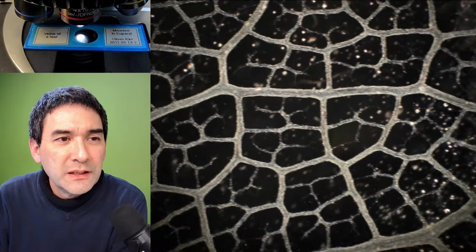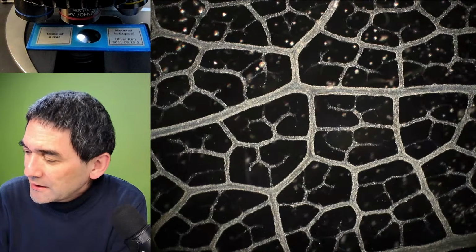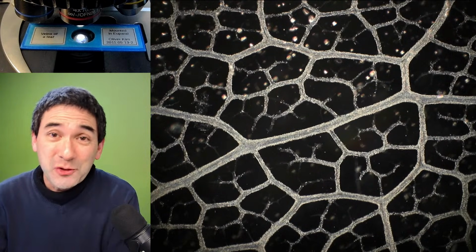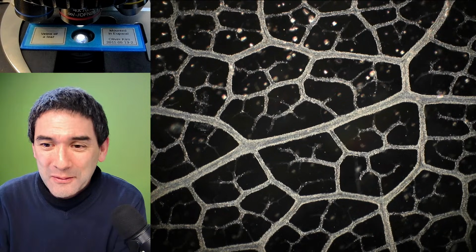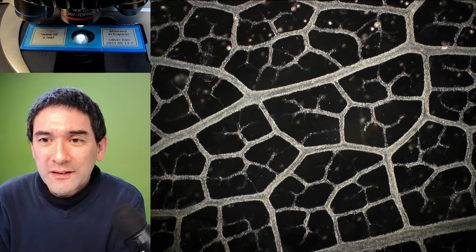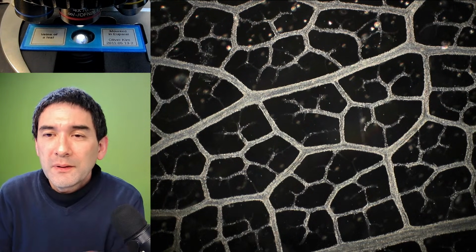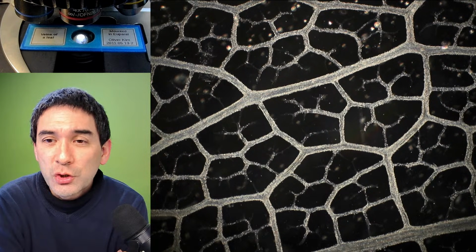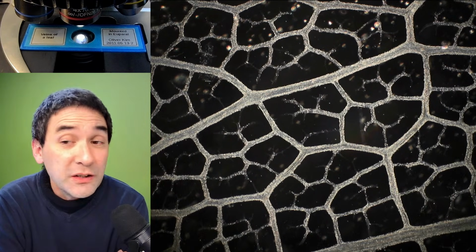And it's also a paper covered slide. I did some experimentation with paper covering slides, because antique microscope slides sometimes are also covered with paper. There's an interesting comment already that old red, green, and yellow paper antique slides should be handled with gloves and surfaces cleaned after contact. They often have arsenic in the inks.